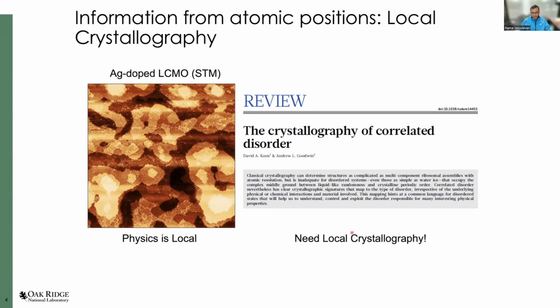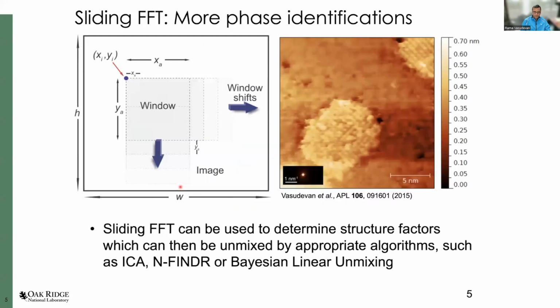And so we lack an understanding of how to describe these kinds of correlations at the local level. What we really need is a language that we term local crystallography, right? So can we look at each atom and its surrounding neighbors and compute statistics on this, to better understand what we're actually seeing in this material system, okay? What's a simple way to do that? Well, the simplest way might be something that we borrow from computer vision techniques, called texture analysis.